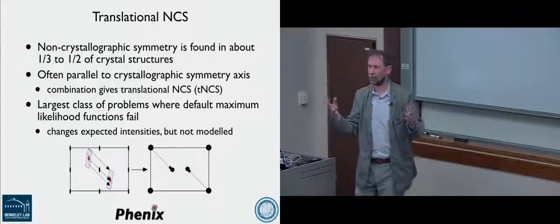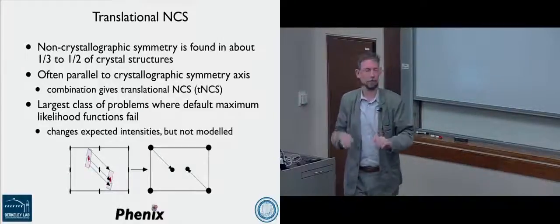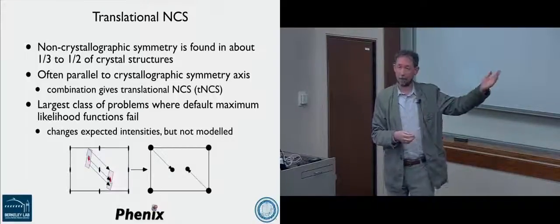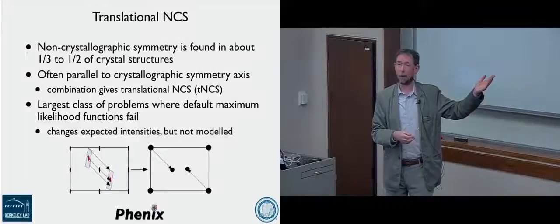You get very strange results. It would put molecules on top of themselves. It would be very strange. And that's because the intensities, when we have translational NCS, are not what we normally expect.